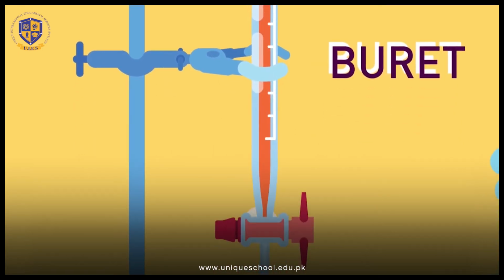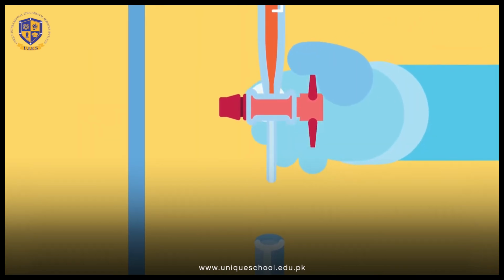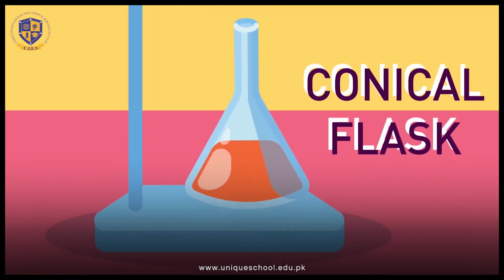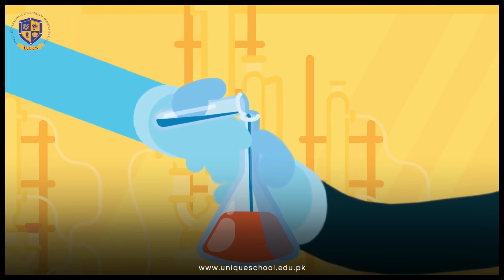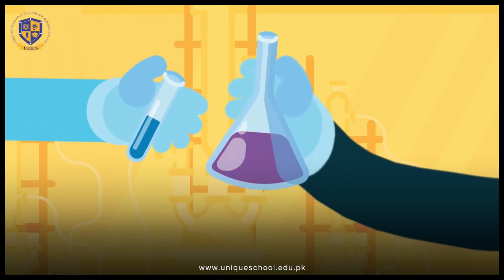Burette. A long glass graduated tube with a tap around it. A burette is used for dispensing an accurate volume of a liquid and measuring its discharge. Conical flask, also known as the Erlenmeyer flask, is a glassware that has a narrow neck that expands towards its base. It is used to hold and mix chemicals. The small neck is to facilitate mixing without spilling.